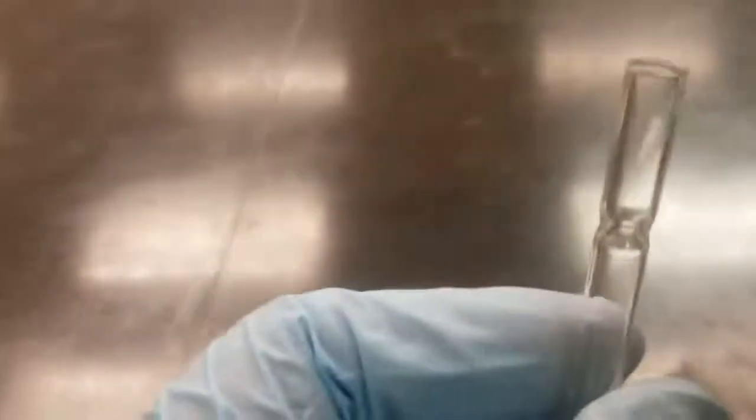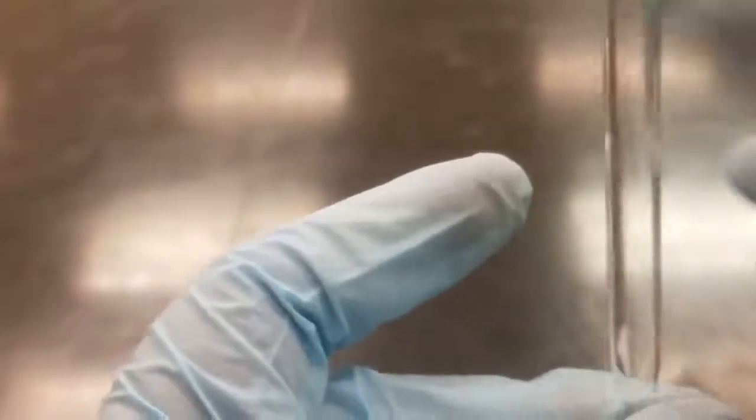Go ahead and put it into the top of the pipette. And then you give a little tap to try to get it down. So we got it down there. And now what you want to do is use your copper wire to push this down.